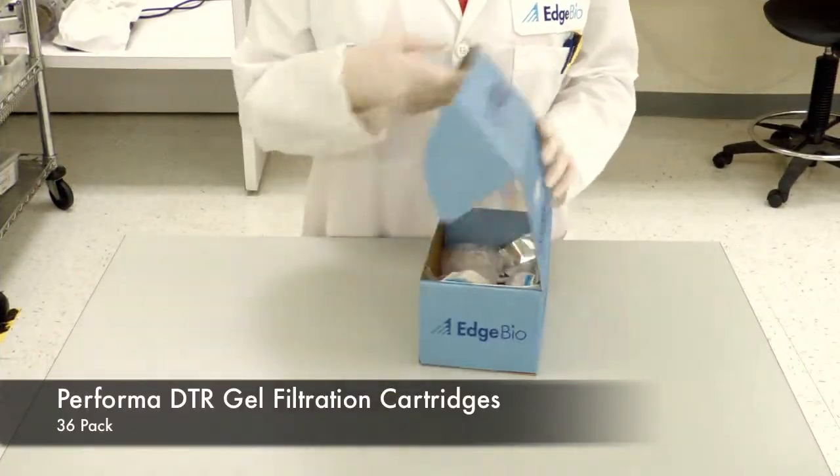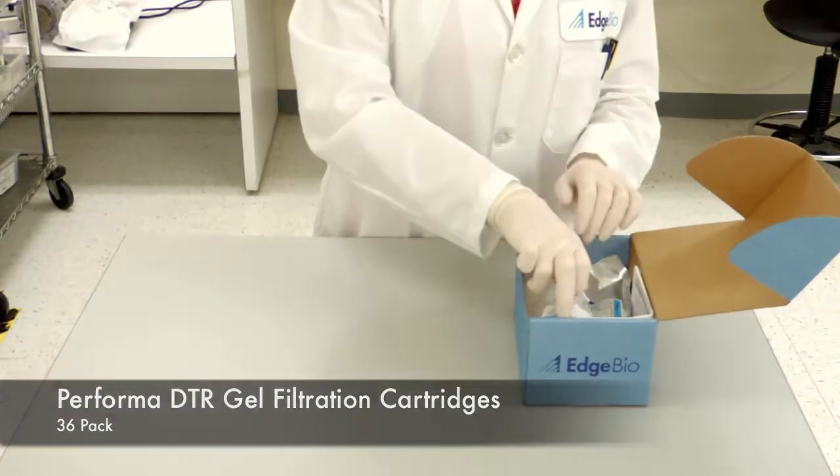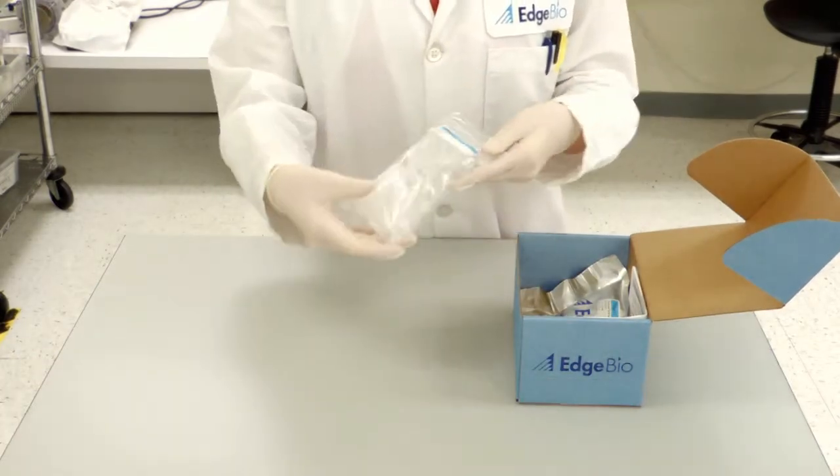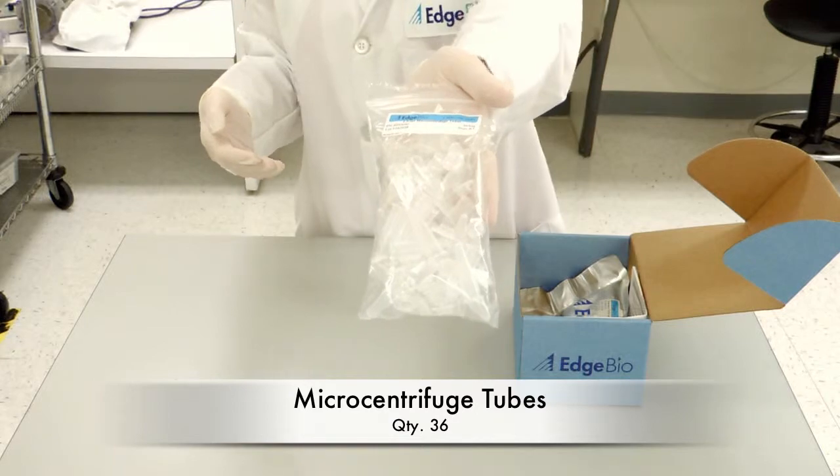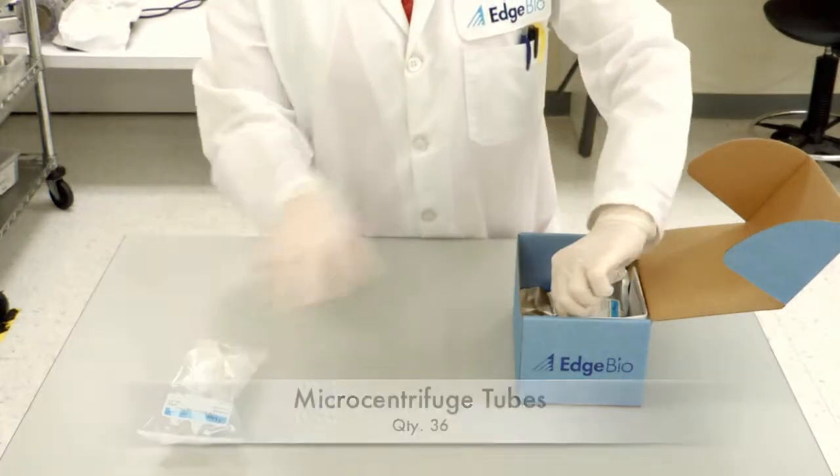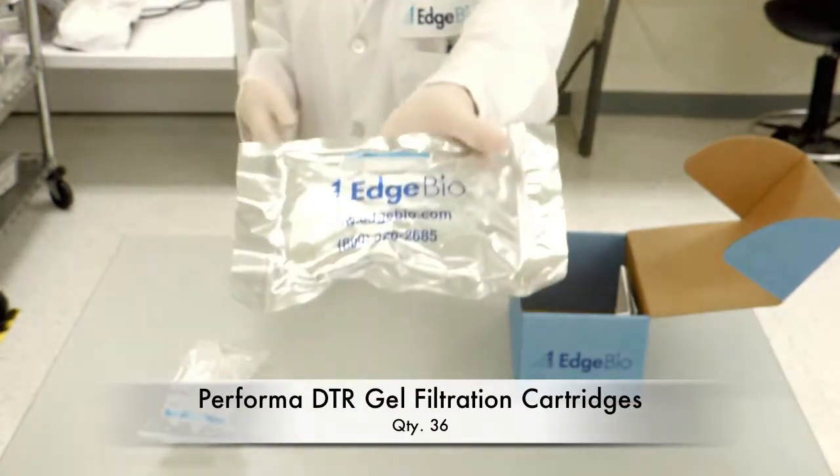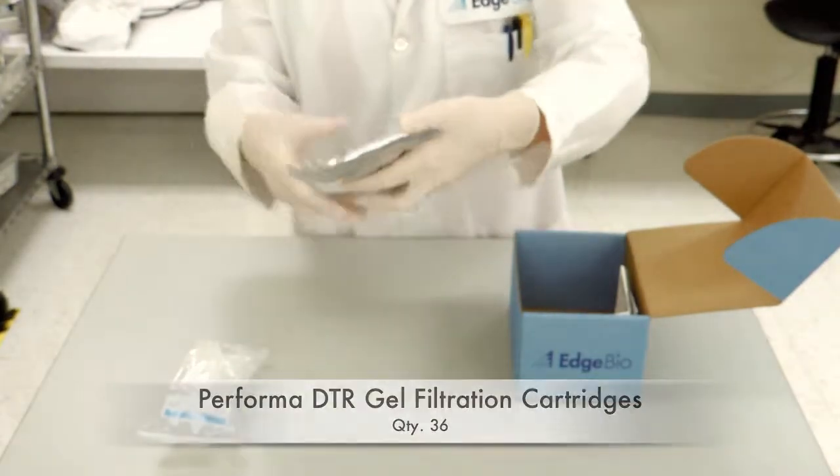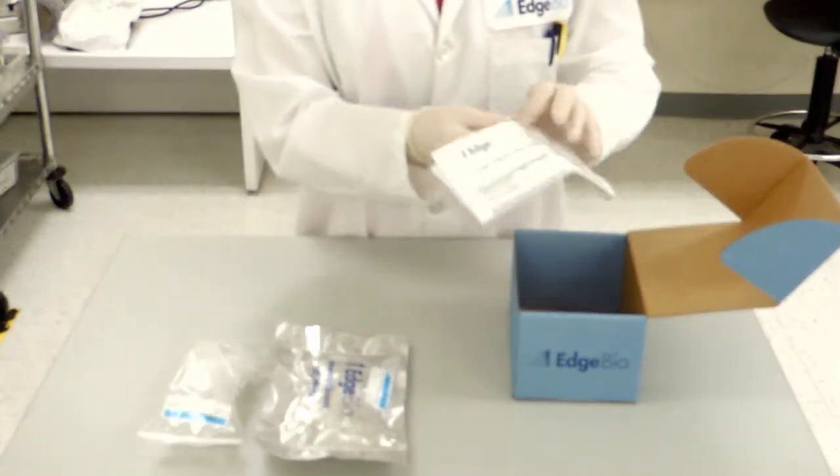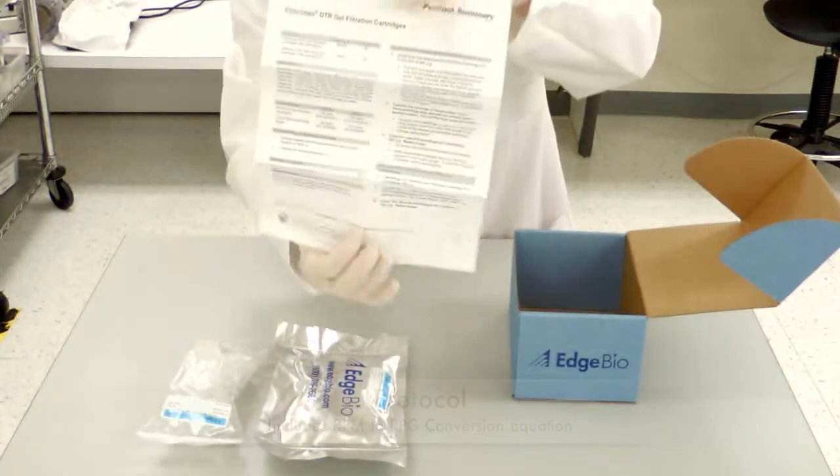Performa DTR cartridge kits come in two sizes, a 36-pack and 108-pack. Within the kit, you will find micro centrifuge tubes and Performa DTR cartridges packaged and labeled in the same manner as our plates.